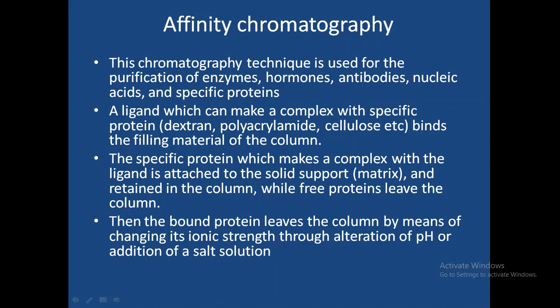Then affinity chromatography. The affinity chromatography technique is used for the purification of enzymes, hormones, antibodies, nucleic acids and specific proteins.